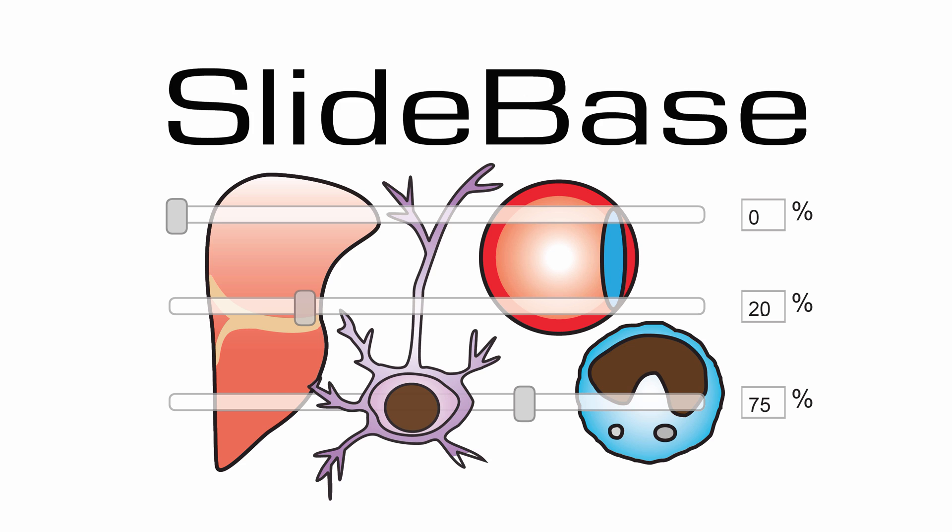In this video I will first walk you through the main resources within Slidebase and then use the Phantom 5 Enhancer and Promoter atlases as examples for the utility of our tool. Lastly, I will highlight the differences between the various resources within Slidebase.